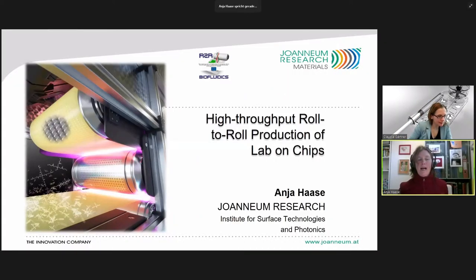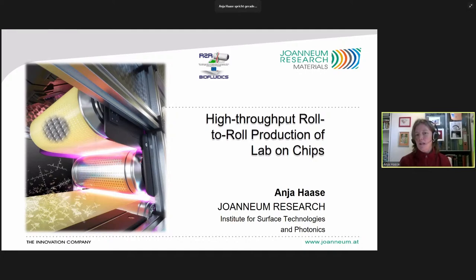Good. So welcome after lunch, or maybe just before lunch. What I would like to do is to give you an insight into a new technology, or not new to us, but new to you maybe. It's high throughput roll-to-roll production of lab-on-chips. Actually, we have many applications, but we want to show production of lab-on-chips. I'm Anja Haase from JOANNEUM Research. That's an Austrian research company, a bit like Fraunhofer in Germany. So we are not really fabricating yet, but I think we have a quite interesting technique.